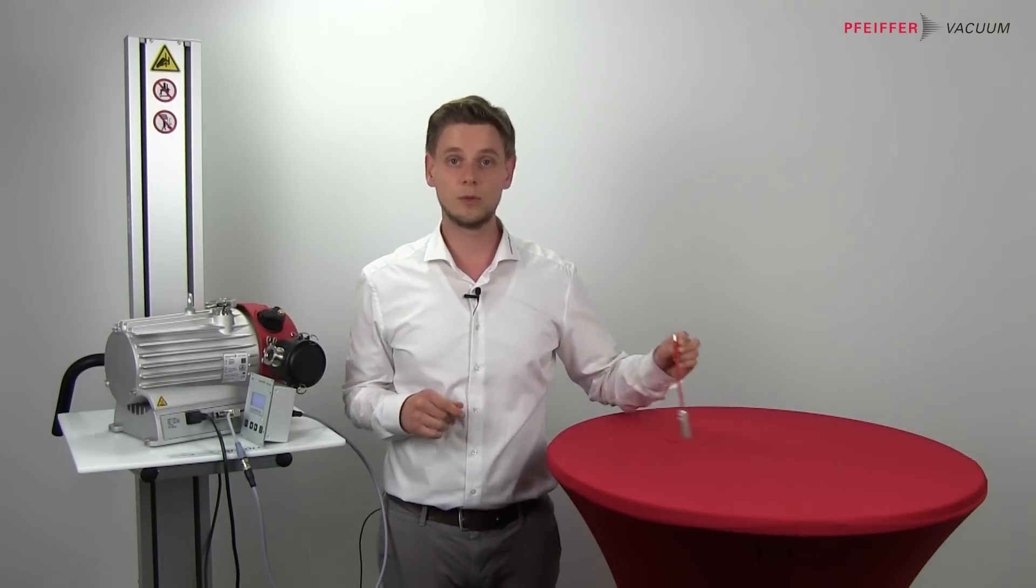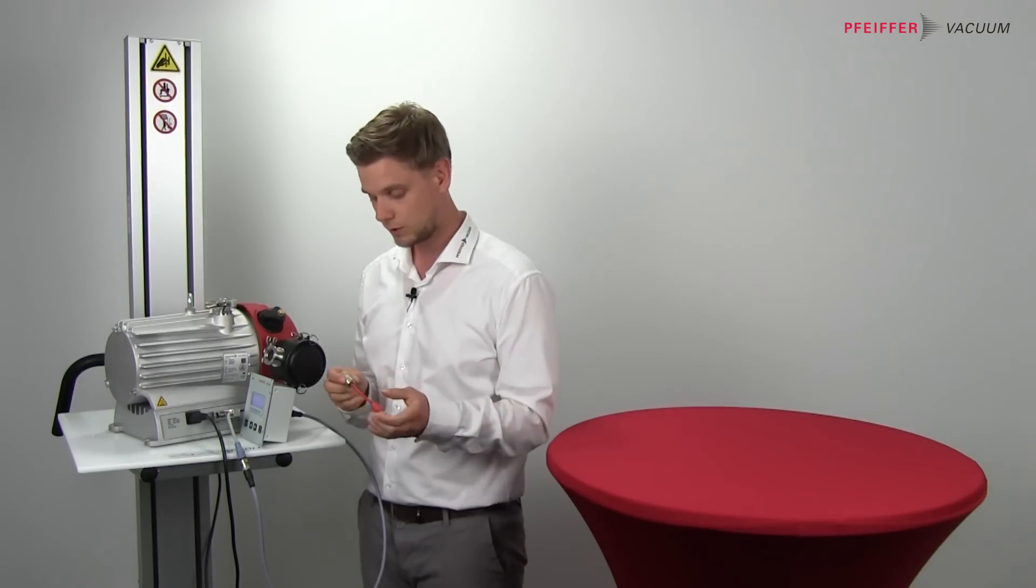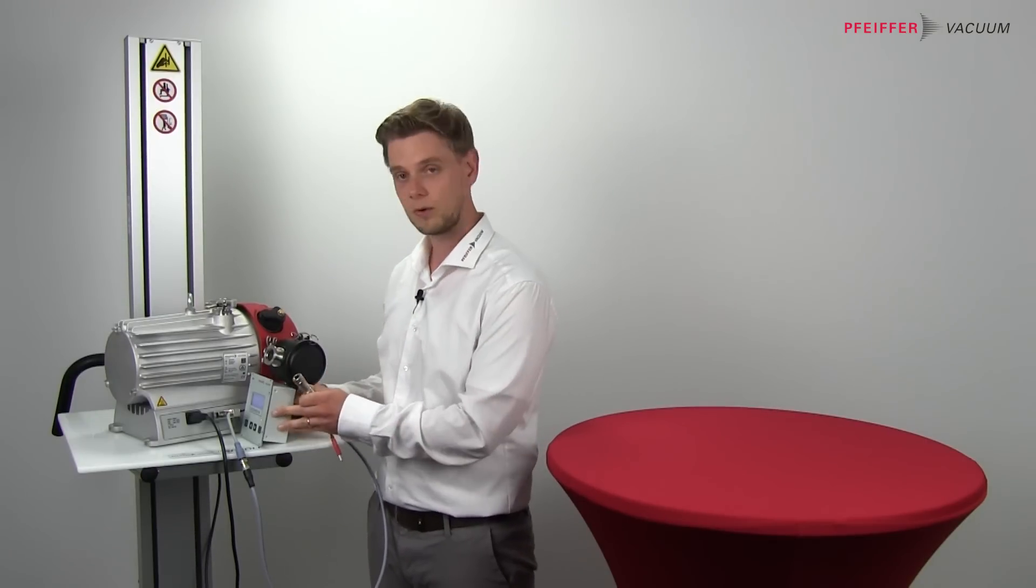And if you would like to connect the PC to your HiScroll, you would just take this adapter instead of the DCU.